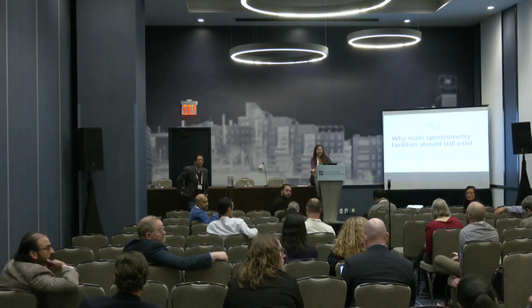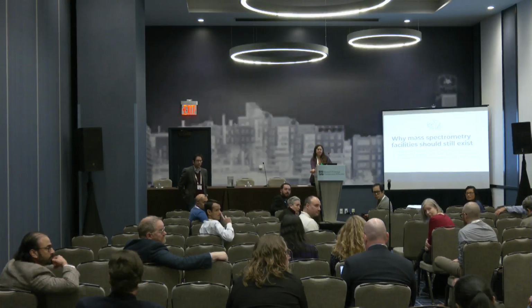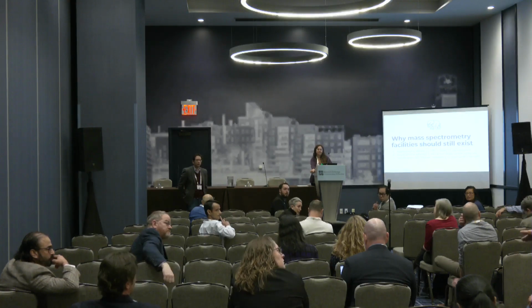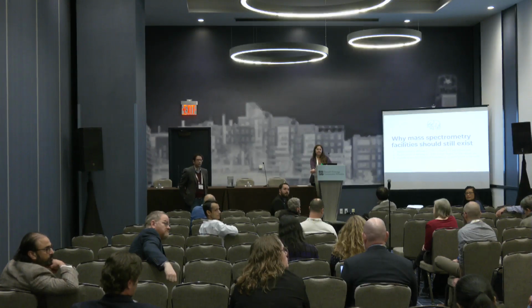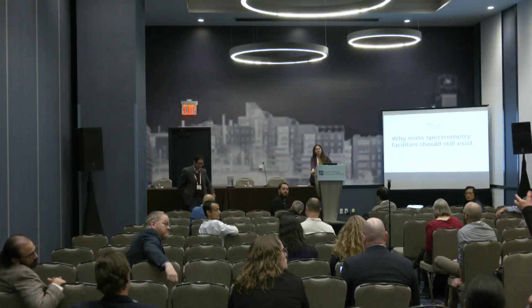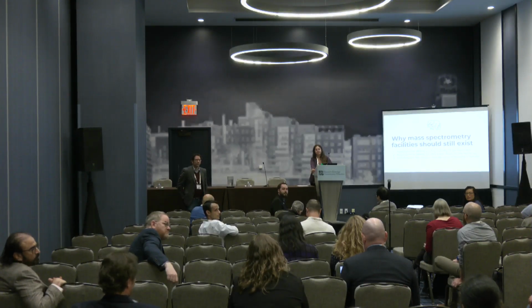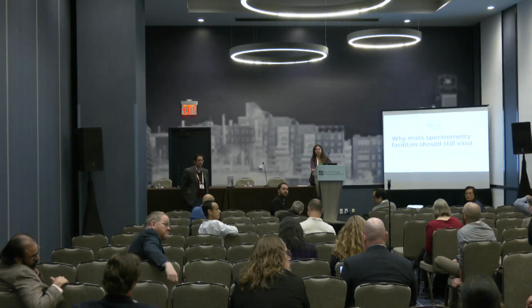Mark? So, Brian, it seems to me that the strength of mass spectrometry is in discovery. We identify those molecules for which you want to make those antibodies or measure for some purpose attached to the biology that we understand. Its ability to do high throughput, many, many thousands of samples in the clinical lab is limited, clearly. So it seems to me trying to make mass spec participate across the entire board is not the goal here. We should focus on how we discover the science, the molecules that are important biologically, and feed those to the SomaLogic folks, to everyone else.